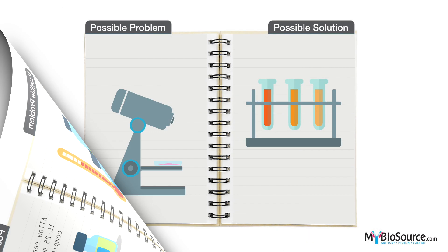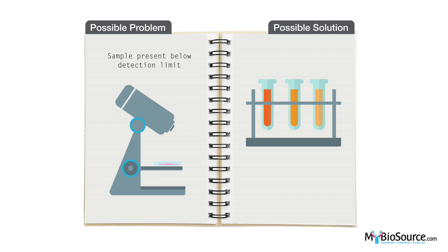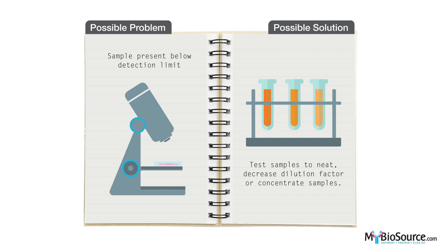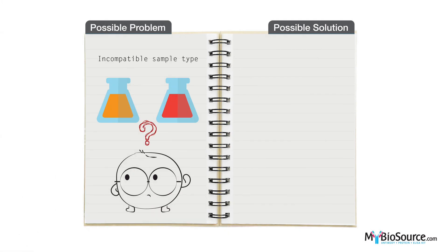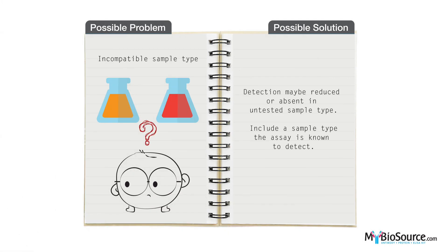In some cases a sample may be present below the detection limit; therefore you may need to decrease the dilution factor, test your samples undiluted, or concentrate your samples. Another possible problem leading to low or no signal is the use of incompatible sample types with our kits. Please refer to the manual and ensure you are using a sample type the assay is supported for and known to detect.